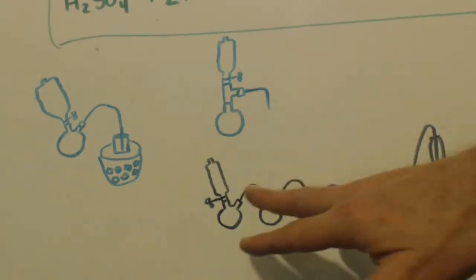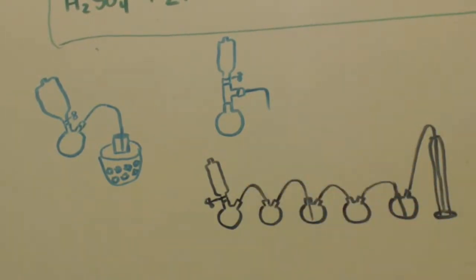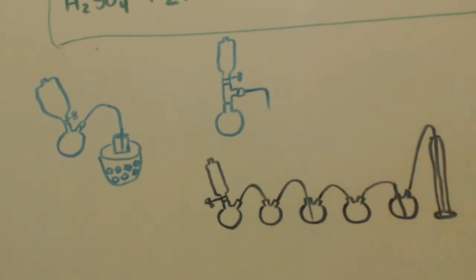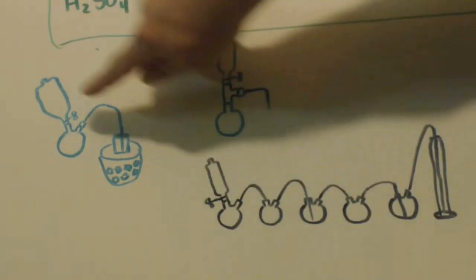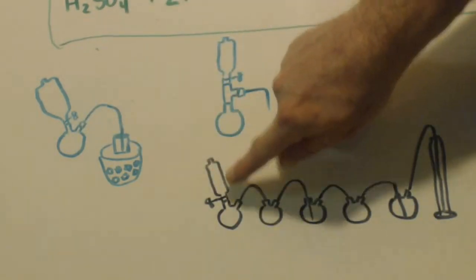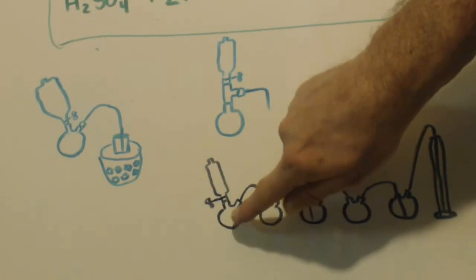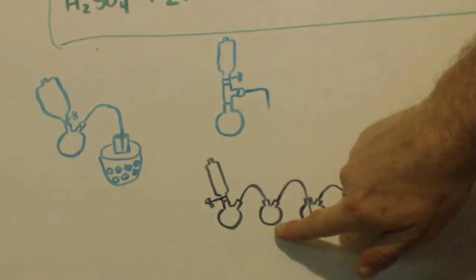Okay. Now this looks nice and simple. That's why I'm showing you on paper, because when you see mine, it does not look like this. All right, because I don't have 1, 2, 3, 4, 5 two-neck round bottom flasks. But anyways, this is the same setup I just showed you over here, right? You've got your sulfuric acid. You're dripping it into your salt. It creates the gas, which comes into here. This is empty.